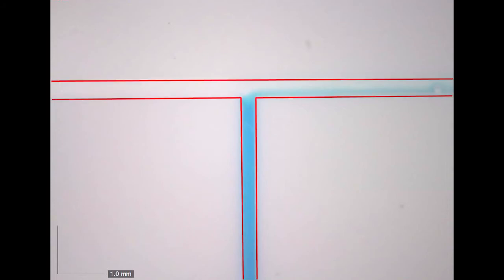Shown here is a magnified view of a microfluidic chip. Channels have been etched into the material and then sealed to allow fluid to flow.